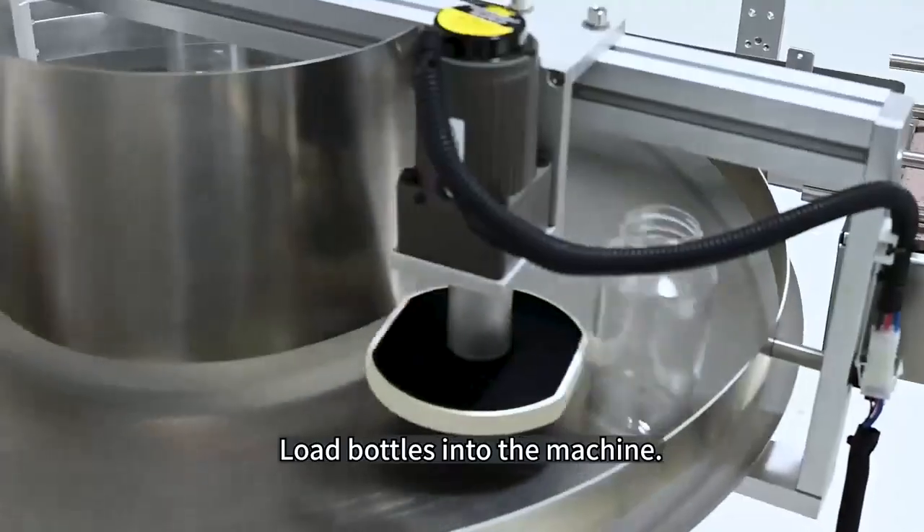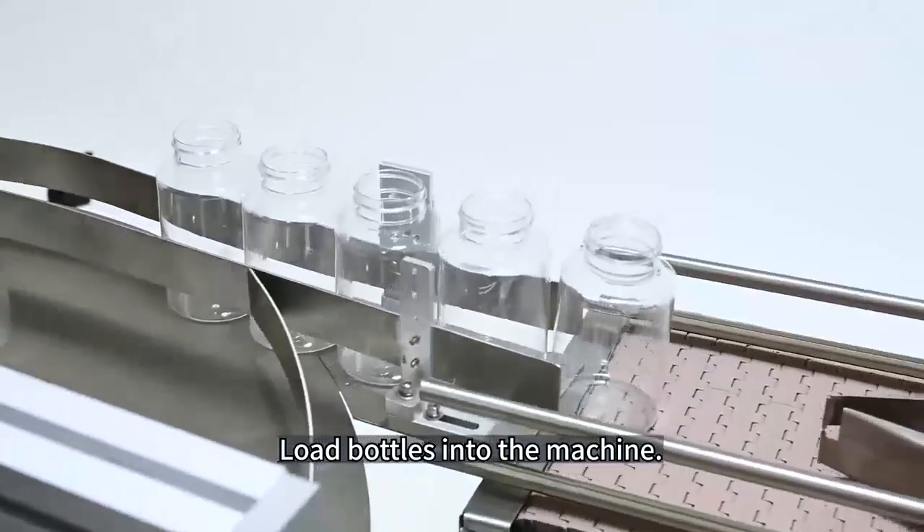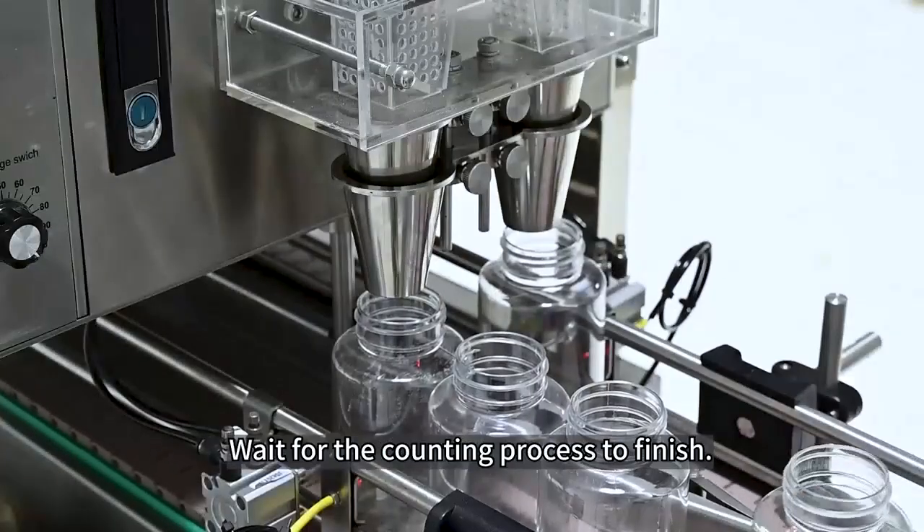Load bottles into the machine. Wait for the counting process to finish.